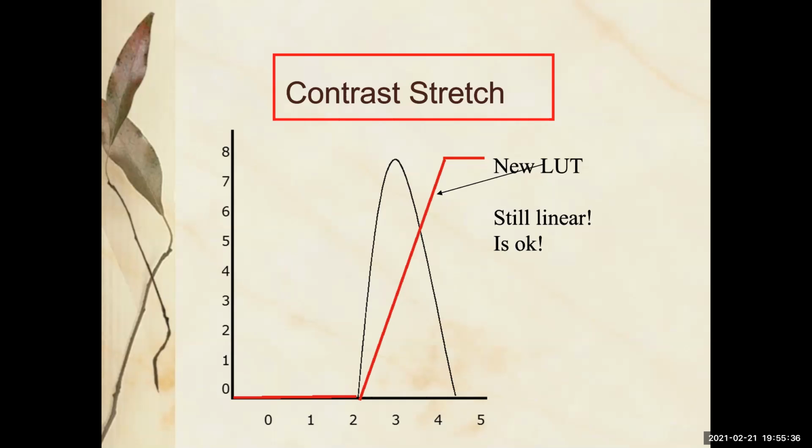So that's the black end. That's the one end of this contrast stretch. We can also mess with the other end, the top values or the highest values in the gray levels. In this case, I'm only taking you to 5 gray levels. And I'm showing you, oh my gosh, 4.5 and above, we're calling it all 5. So we're throwing away any data on both ends because we're really confident that there isn't data. There's only data where there's signal. And I'm going to use this new Z-shaped lookup table as my lookup table. And what I've just done is called a contrast stretch.